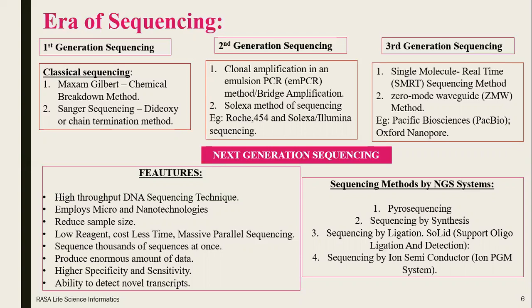Now, DNA polymerase can then be added to the wells, and each nucleotide can be washed over in turn. And then the dNTP incorporation is monitored and visualized by detecting the fluorescent reversible terminator nucleotides at the end of the preceding extension reaction, requiring cycle by cycle measurements and removal of terminators.